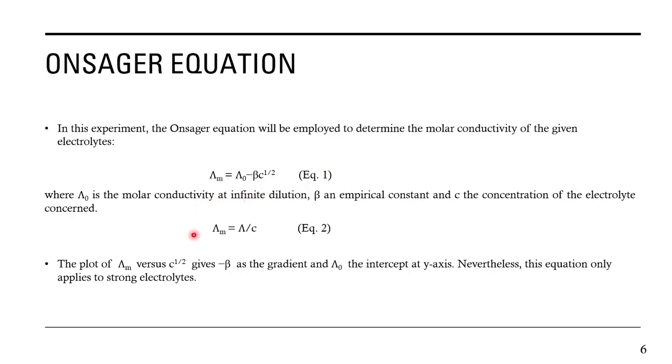The molar conductivity is defined as the conductivity that you measure, averaged over 3 measurements as shown by Dr. Faisal, divided by the concentration of each solution prepared.